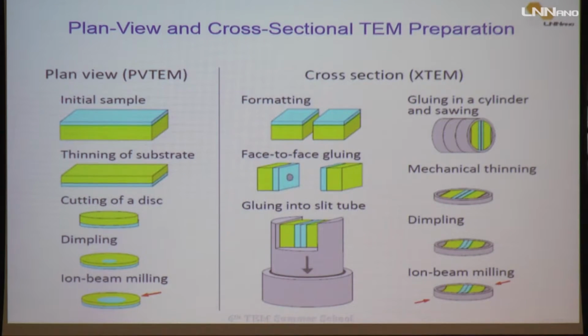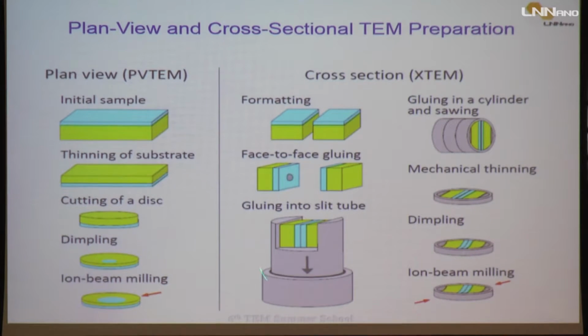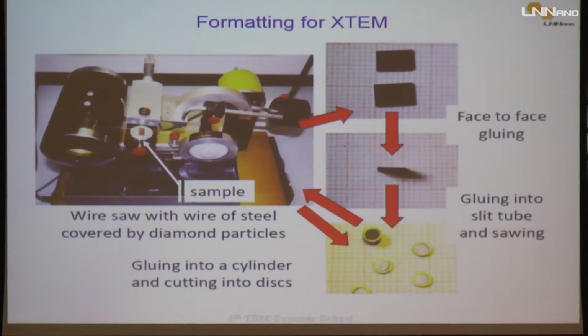Okay? Now I will talk about and show the instruments related with each of these parts of the preparation, okay? I will talk about the cross-sectioning preparation.